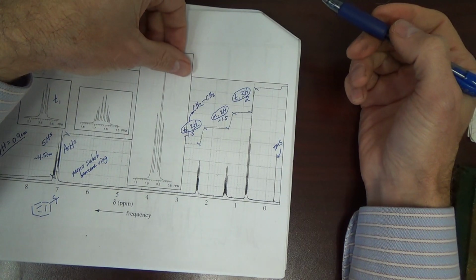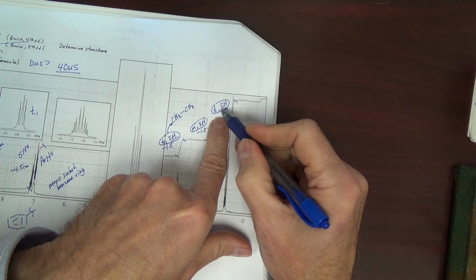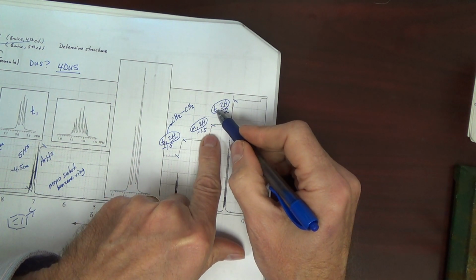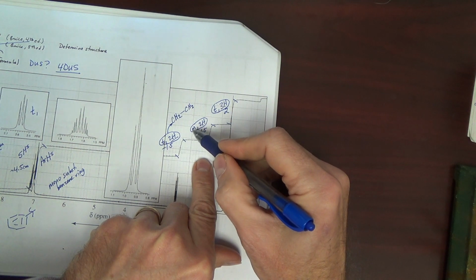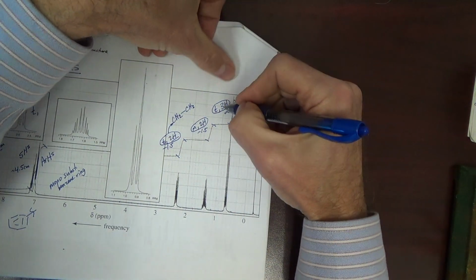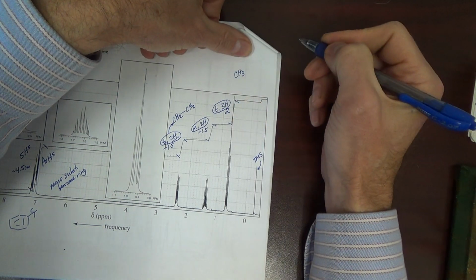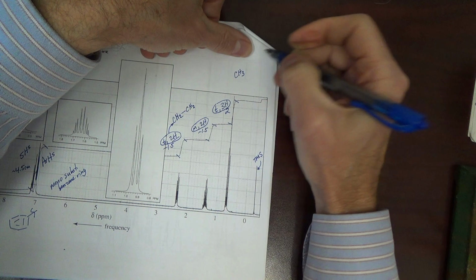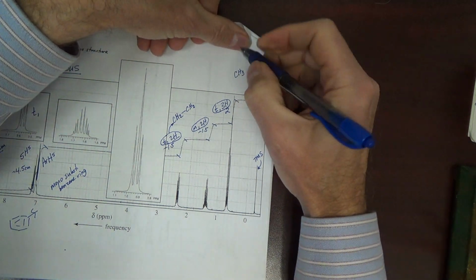Now, I'm going to go over here to this triplet because a triplet is easier to deal with than a multiplet. Multiplet usually is going to come from complex splitting. Triplet. First off, it's a 3H. That means it's a CH3, most likely. What makes it a triplet?